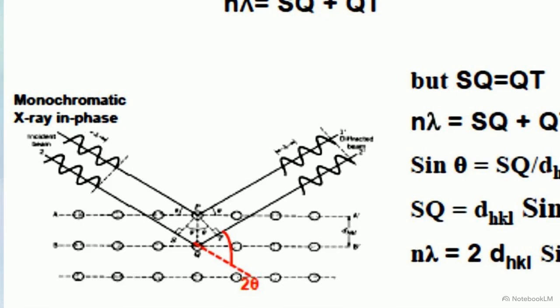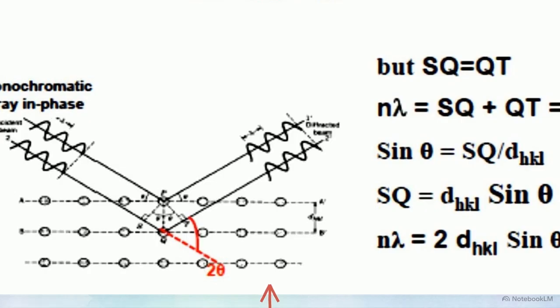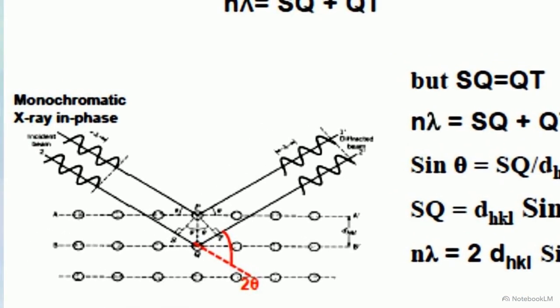This diagram shows exactly how X-rays interact with atoms. When the incoming X-ray beam hits these stacked atomic planes, the waves scatter. As they bounce off different layers, they interfere with each other at specific, measurable angles. Notice the angle marked with the red symbol. The distance between atoms dictates the exact angle where these X-rays reflect perfectly in sync. Because every chemical compound has a unique atomic spacing, this pattern of angles acts as a literal barcode, a unique fingerprint for every mineral on Earth.